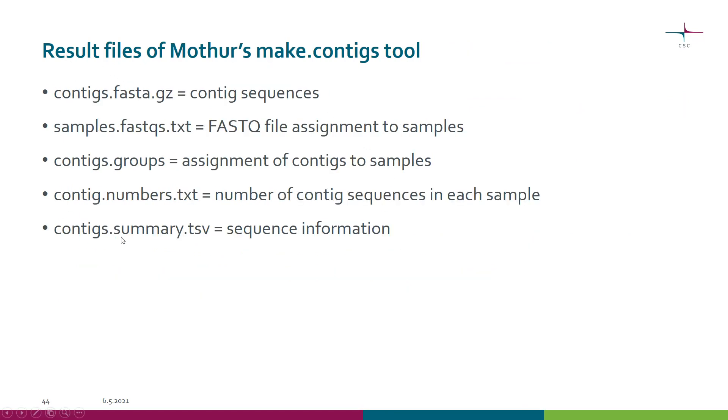You get various result files. Obviously the contigs themselves - they are now in FASTA format and this file is compressed. In addition to the actual contigs you get a lot of other information, so let's look at these files one by one.